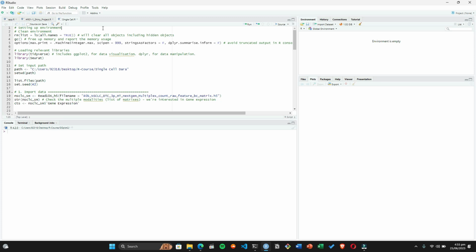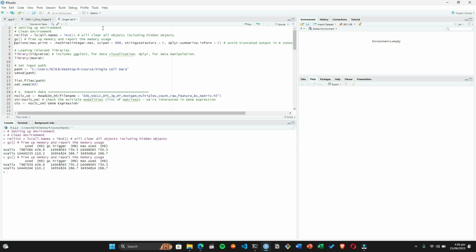First of all, we are going to clean the environment and clean some RAM as well. So RAM is also being cleaned. I'm going to clean it again. So 962 megabytes are available. So we are going to use this and then set the libraries.